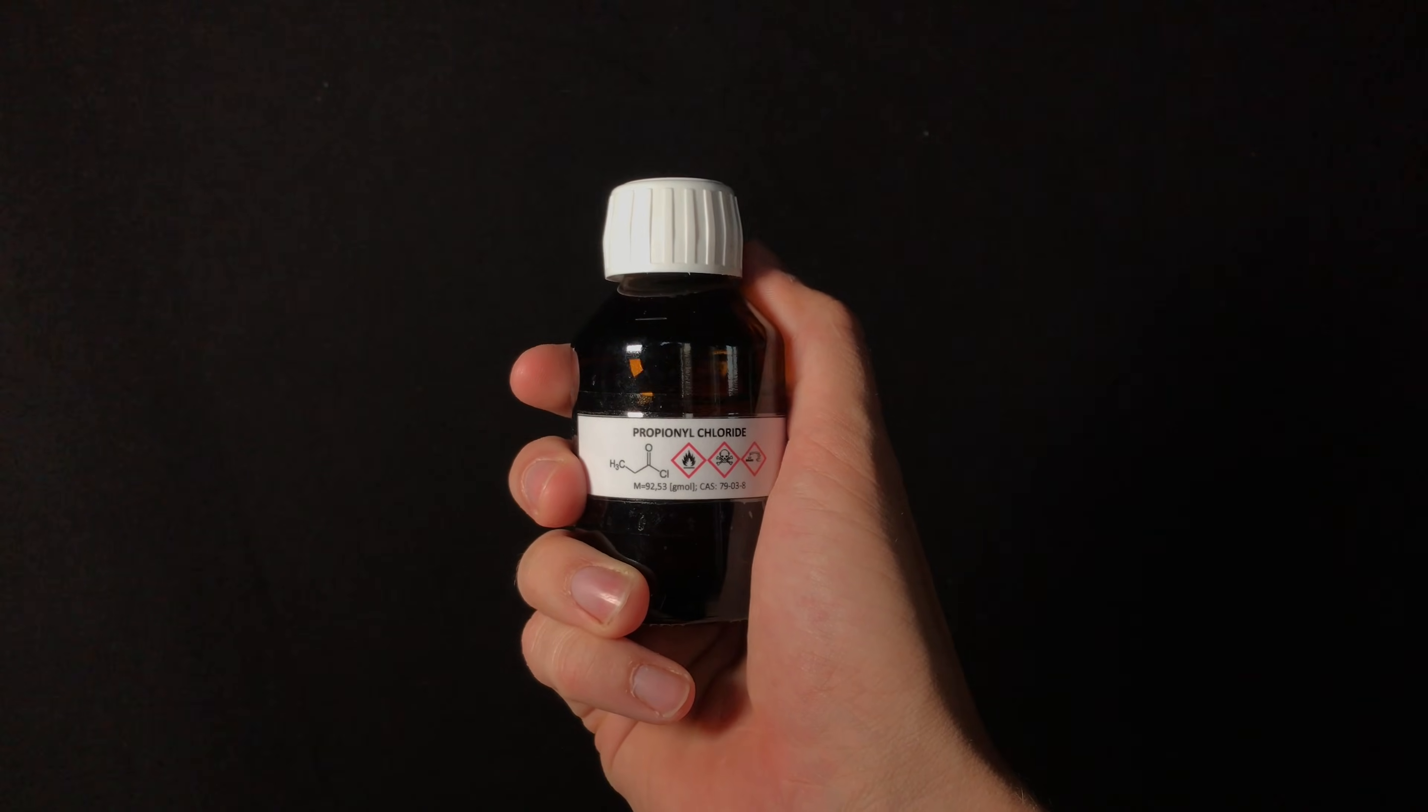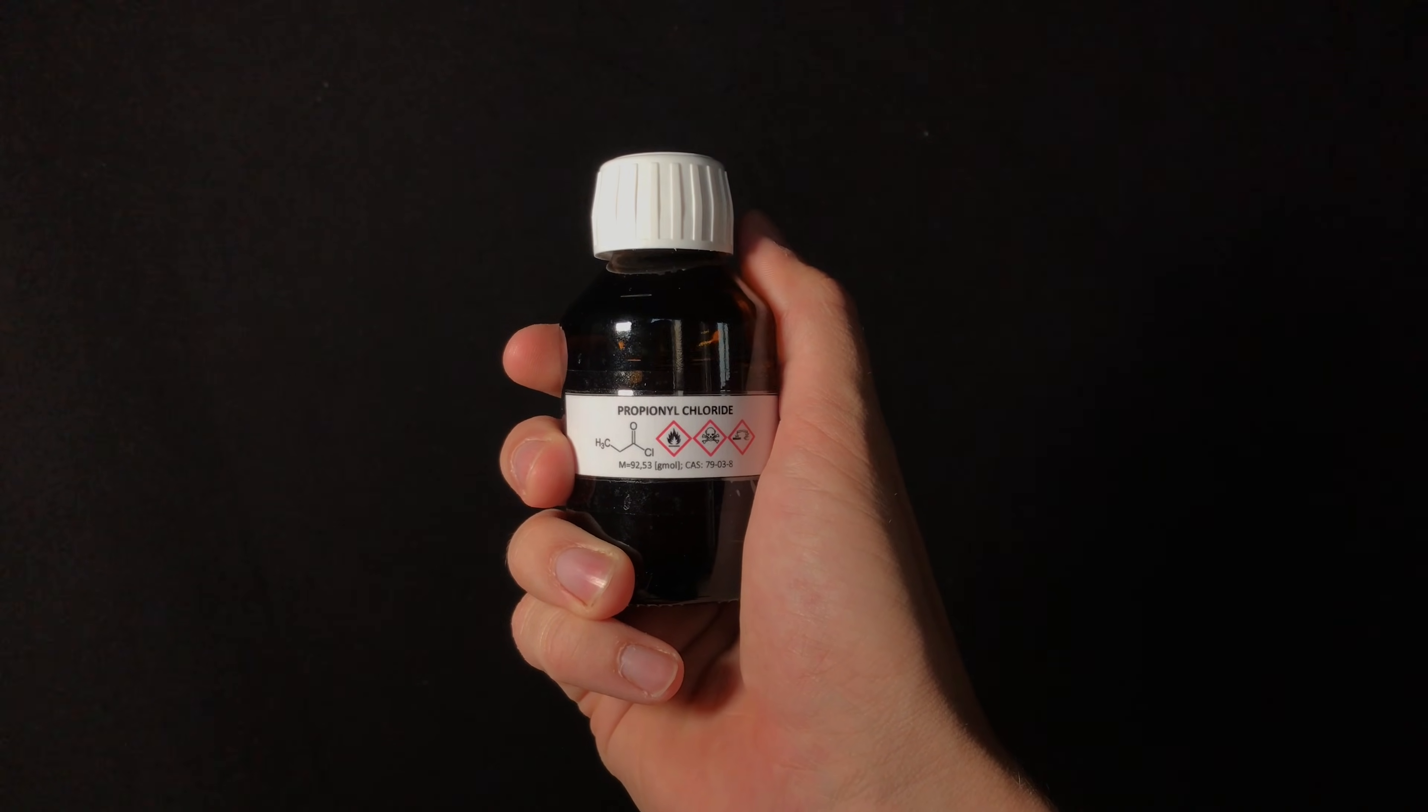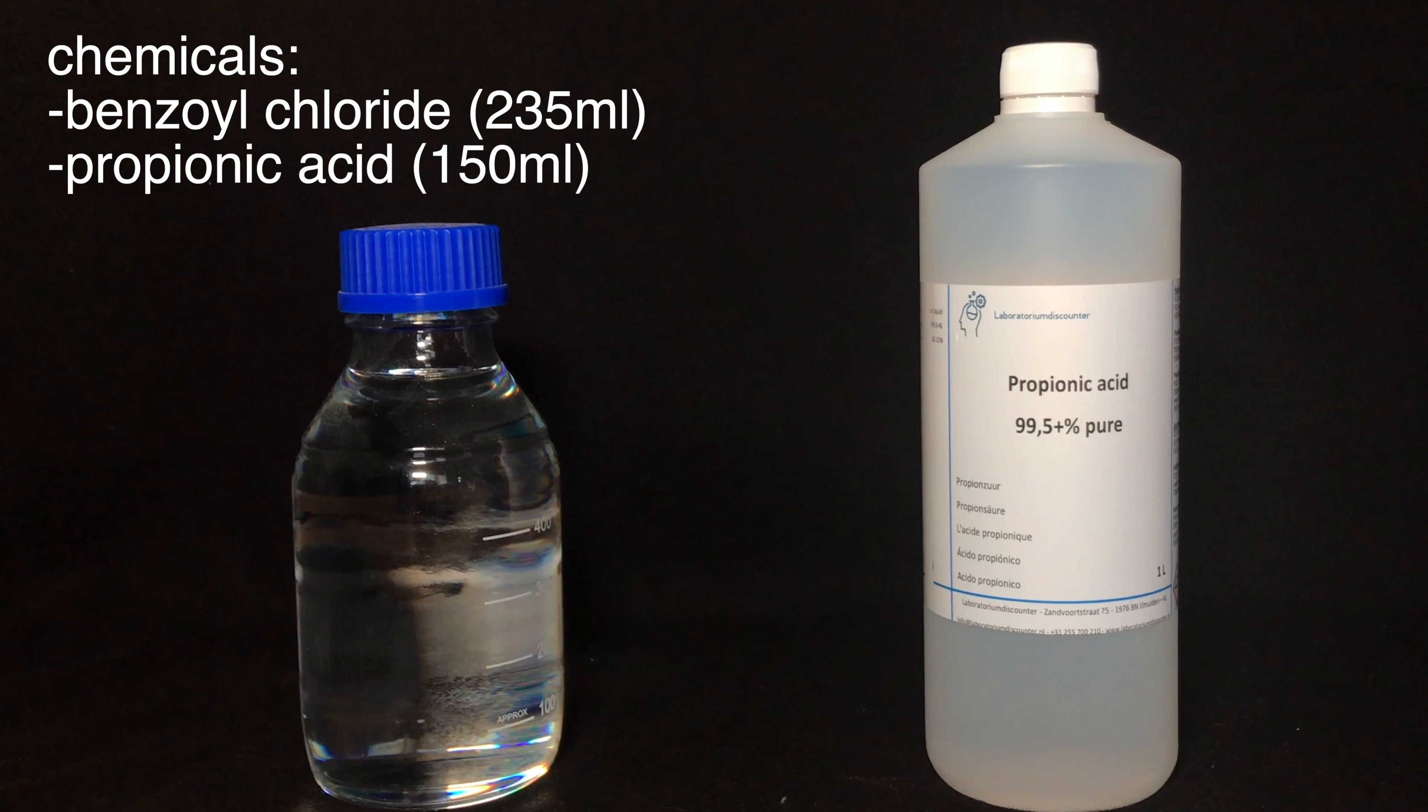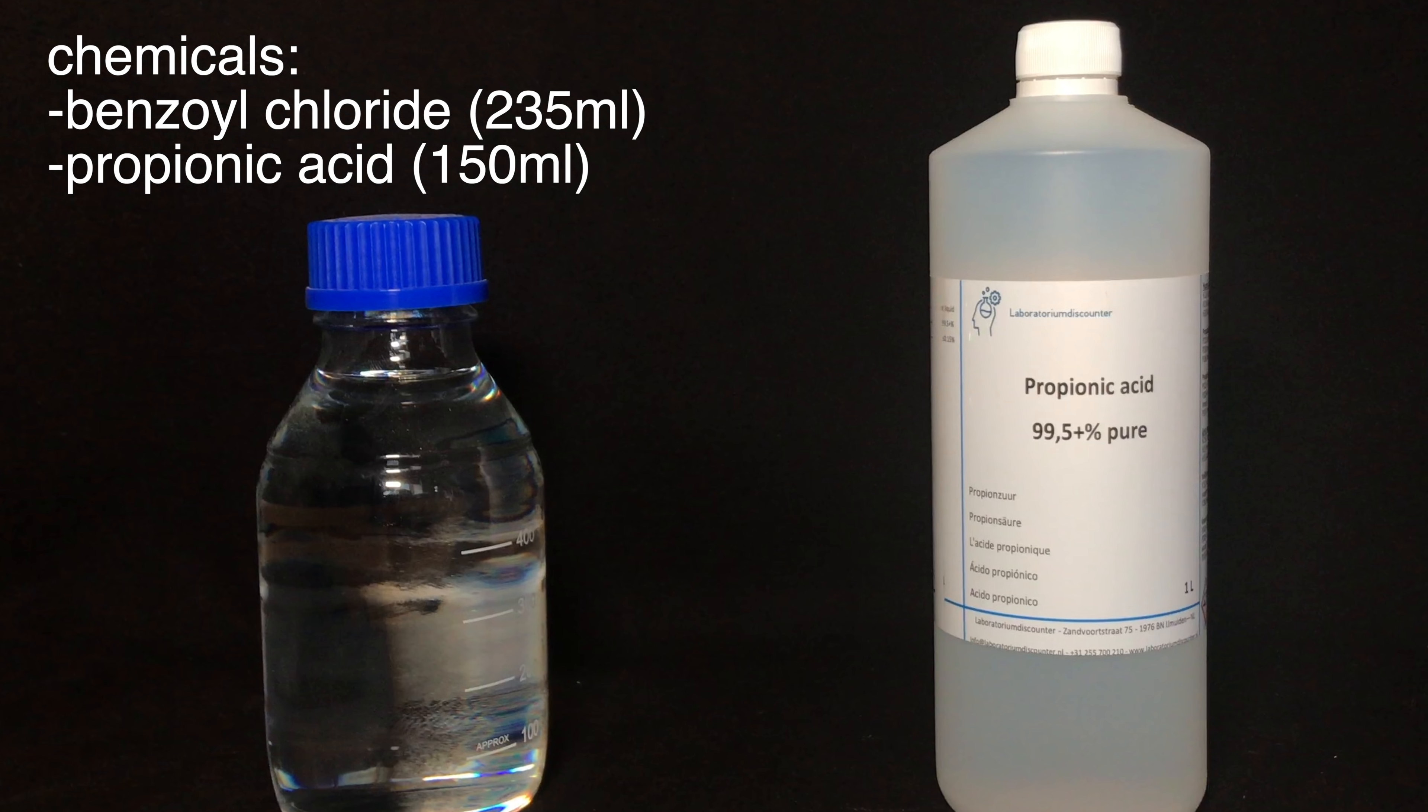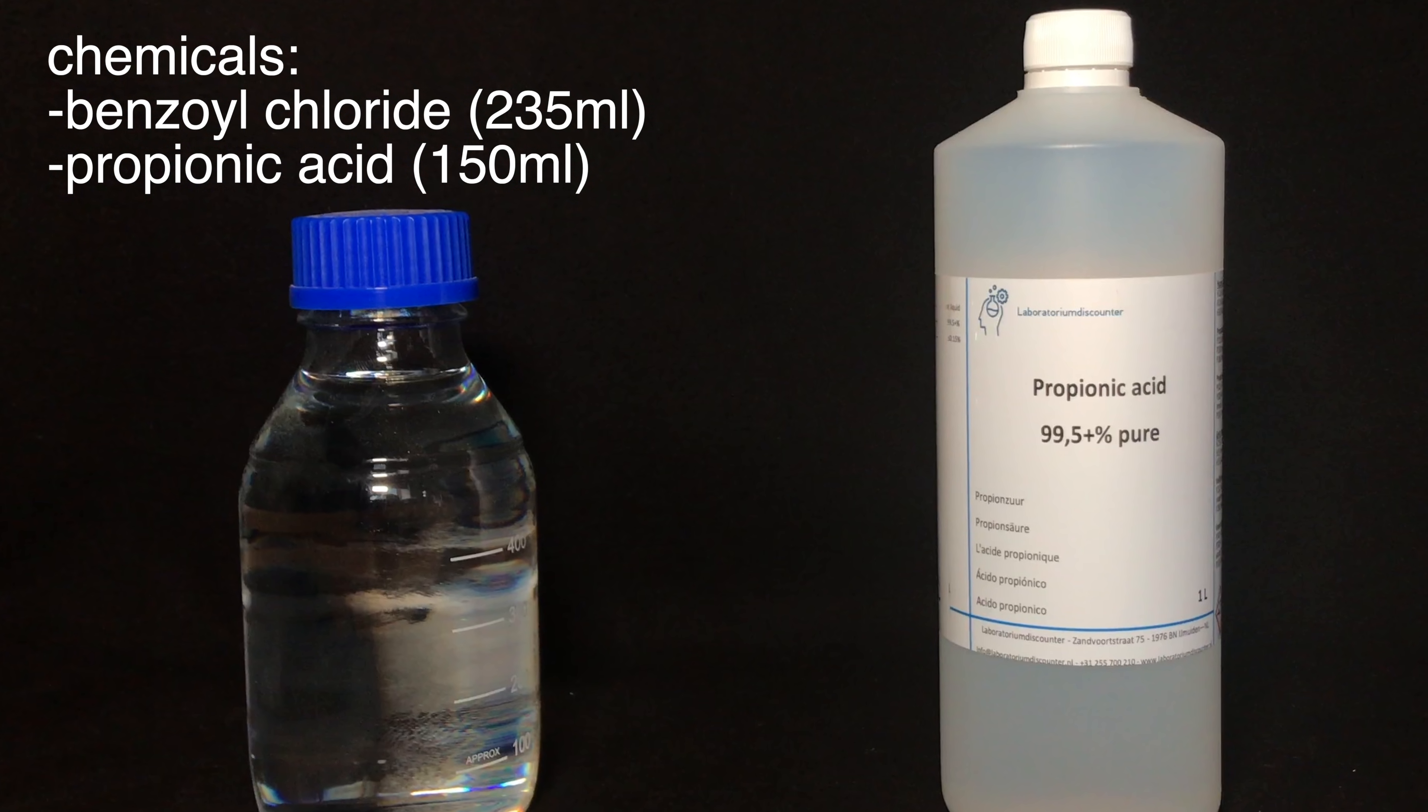Welcome everyone, today I will show you how to make propionyl chloride. This stuff can be used in chemistry to make esters very easily. For the preparation we are going to use a little over 2 moles of benzoyl chloride and exactly 2 moles of propionic acid.